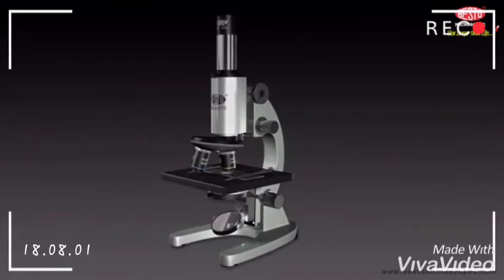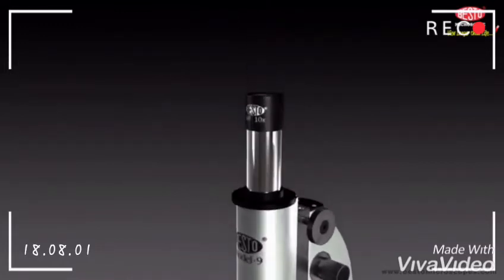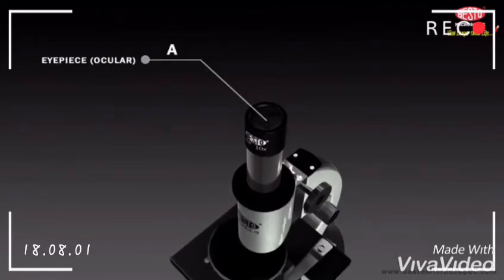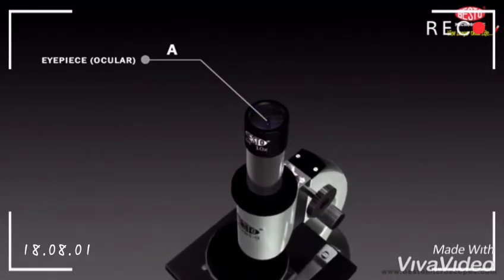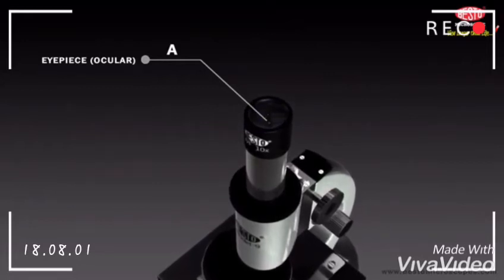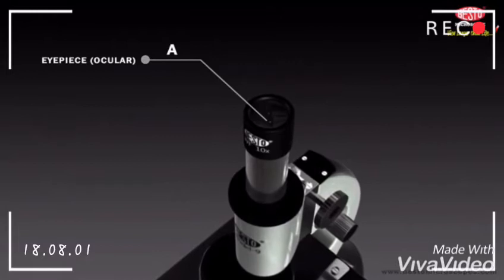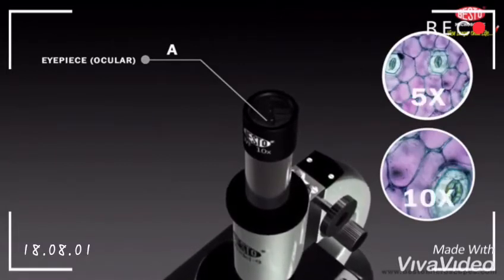The eyepiece or ocular is the part of the microscope closest to your eyes through which you look. It contains the ocular lens, which makes the image produced by the objective lenses larger. An eyepiece may be labeled with its magnification, for example, 5x or 10x, meaning it enlarges 5 times or 10 times.